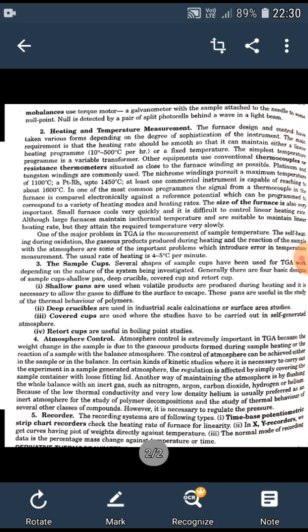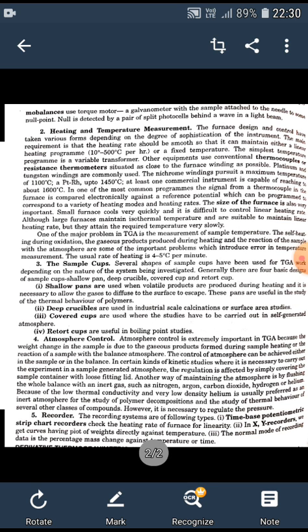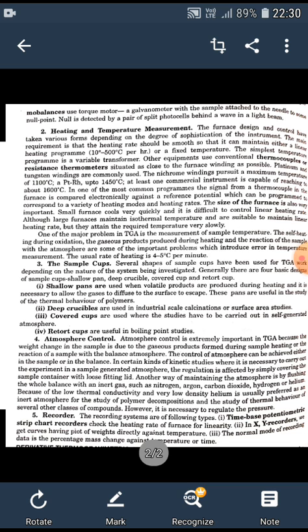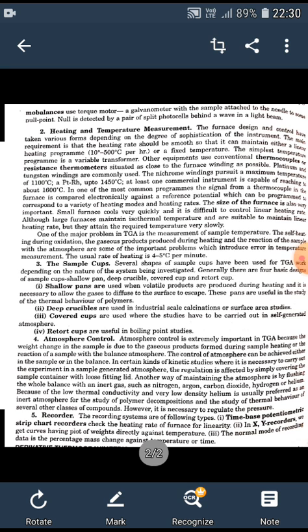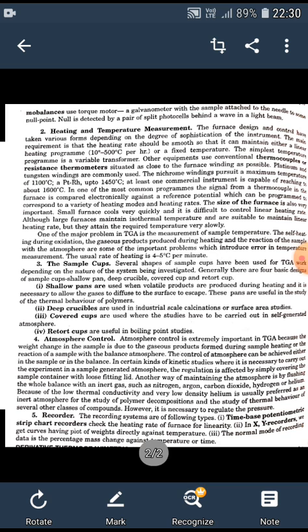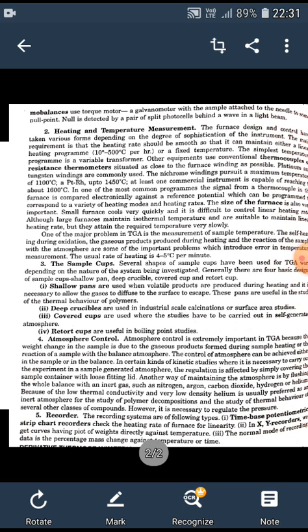Another requirement in the instrumentation is the sample cups. Several shapes of sample cups are used in thermogravimetric analysis depending on the nature of the system investigated. There are four basic designs of sample cups: shallow pan, deep crucible, covered cup, and retort cup. Shallow pans are used when volatile products are produced during heating and it is necessary to allow the gases to diffuse to the surface to escape. These pans are useful in the study of the thermal behavior of polymers. Deep crucibles are used in industrial scale calcinations or surface area studies. Covered cups are used where the studies have to be carried out in a self-generated atmosphere. Retort cups are useful in boiling point studies.